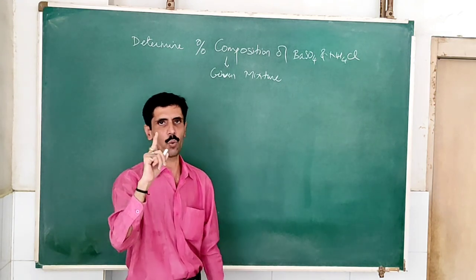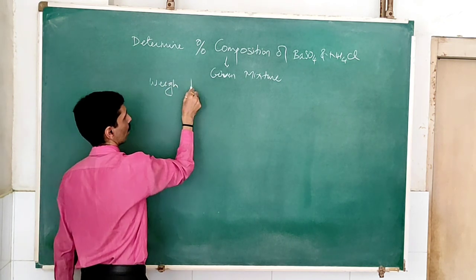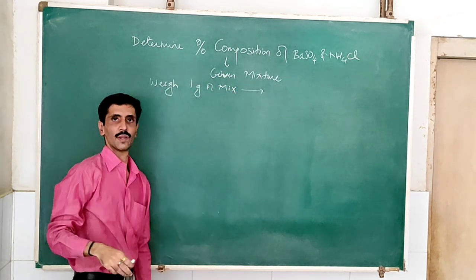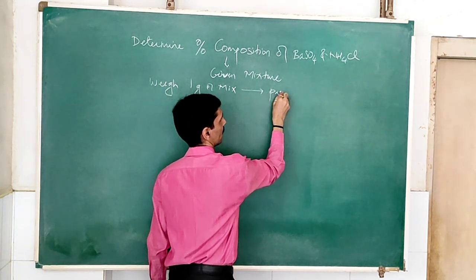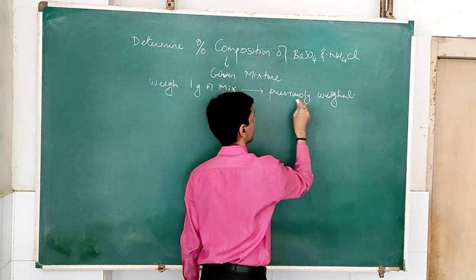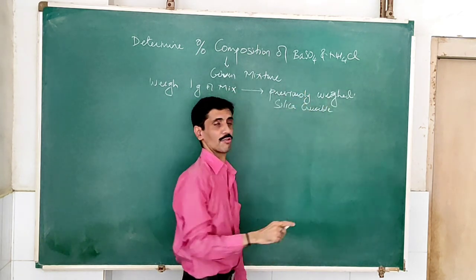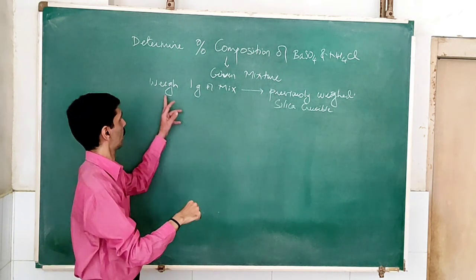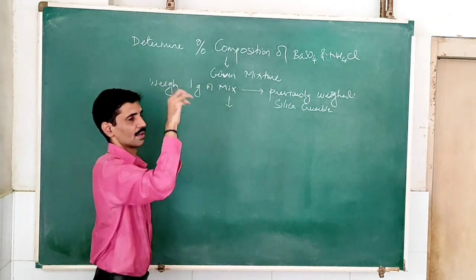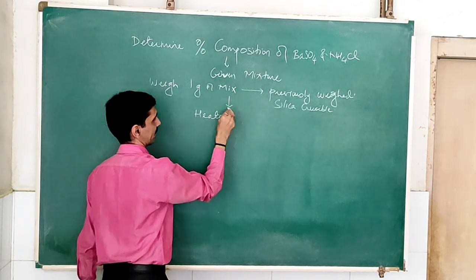To start with, step number one: we are going to weigh one gram of the mixture in a previously weighed silica crucible. We have to first weigh the silica crucible and into that we are going to take one gram of the mixture. And then we are going to heat it.